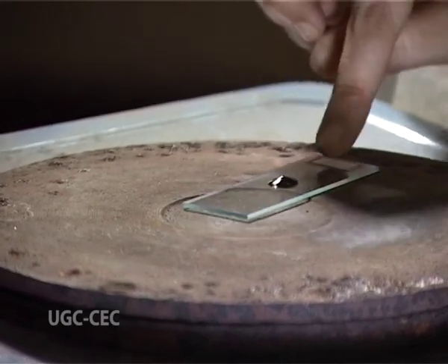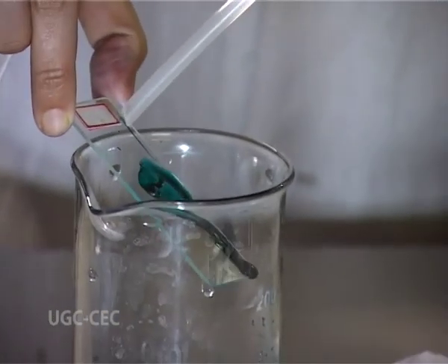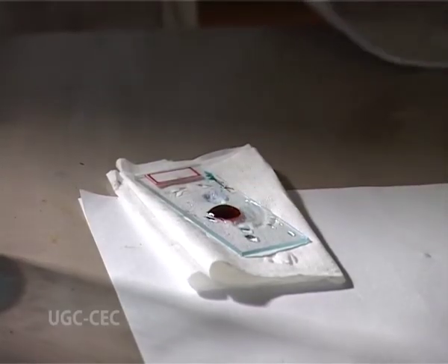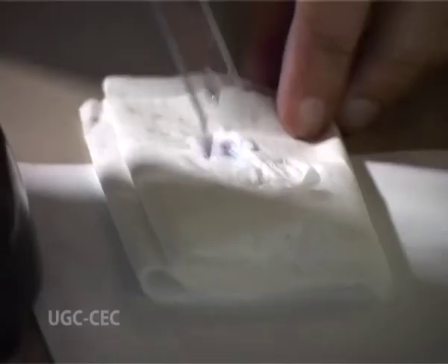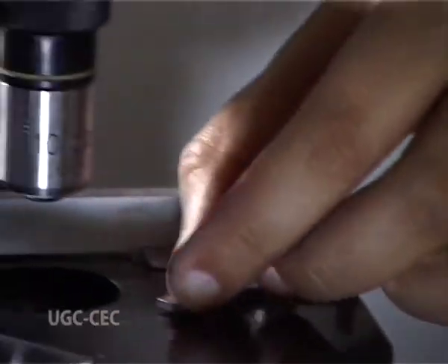Then after keeping it for 5 minutes, we cool it first and then wash it with water. And then stain it with safranin, and again we keep it for 1 to 2 minutes. And then we wash it with water, air dry the smear, and then we see it under the compound microscope.